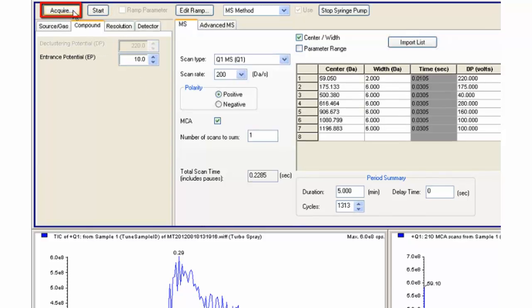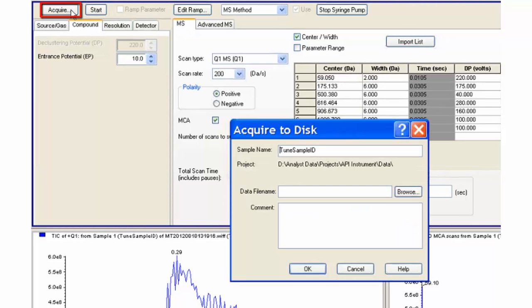The Acquisition button is used when saving the data generated is needed. In this case, once the TIC is stable and peaks are seen in the spectrum, the instrument status can be examined for proper resolution, calibration, and sensitivity.